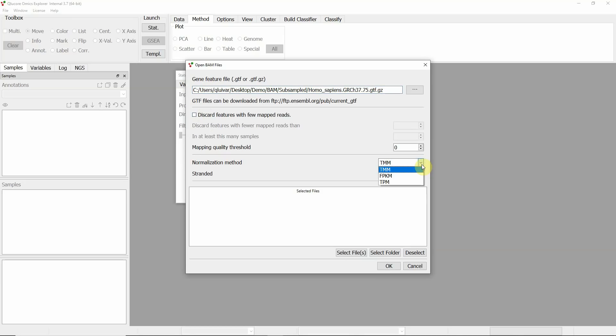For normalization, there are three options and we recommend the use of TMM which considers both the lengths of genes and the RNA content of the sample.